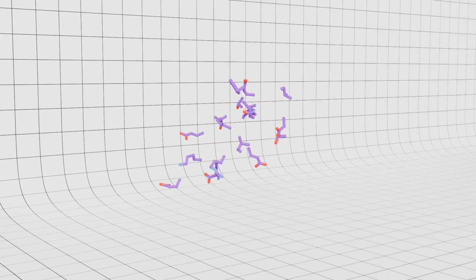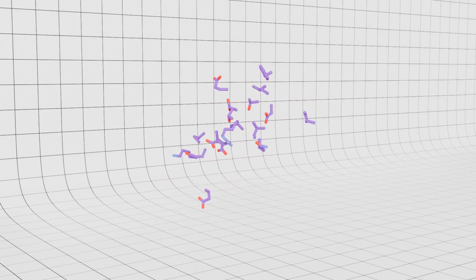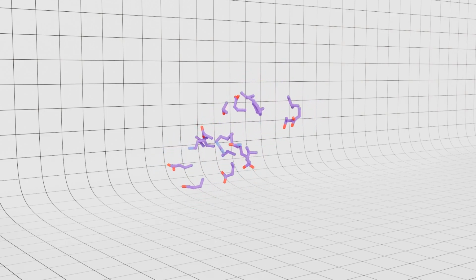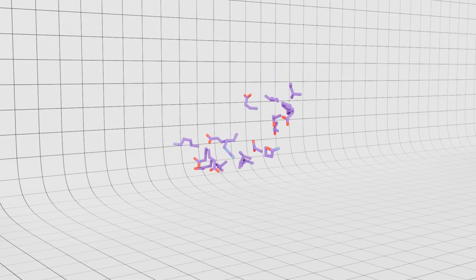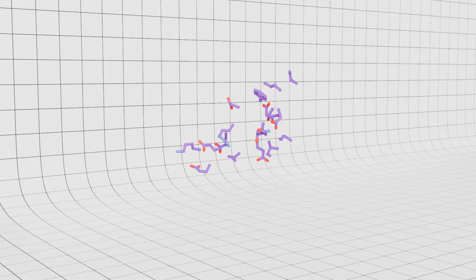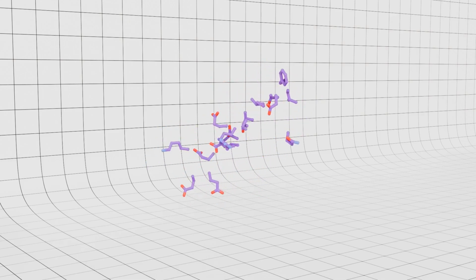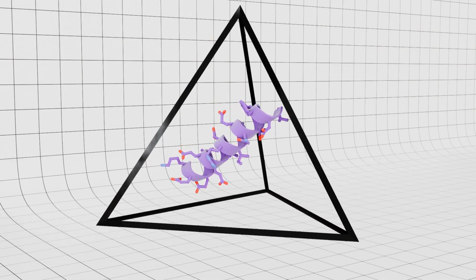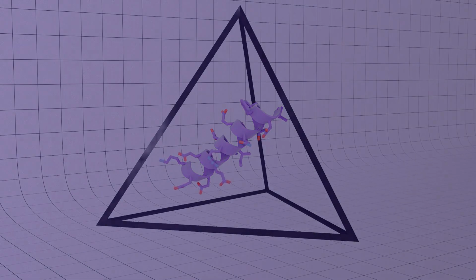If we ever think that that's what should be happening, that means that our model is overfitting noise. That's probably not what's actually happening in our protein. It's just all the residues blowing up and moving apart from each other. And so that's another nice thing that these mesh constructs do: they impose the restriction that within a tetrahedron, we know that things aren't moving apart from each other. So that's why we need a mesh.